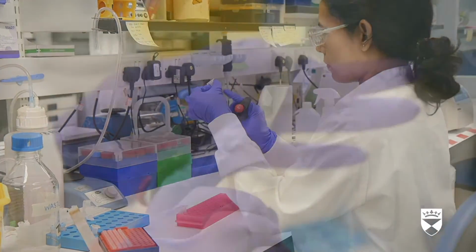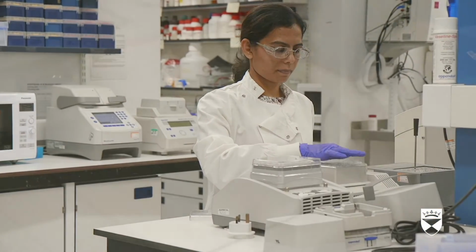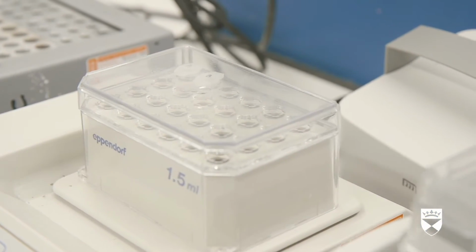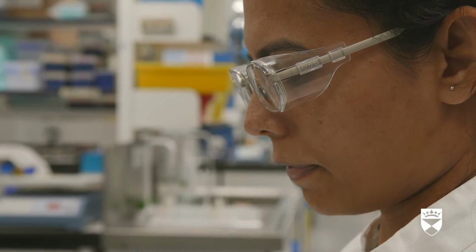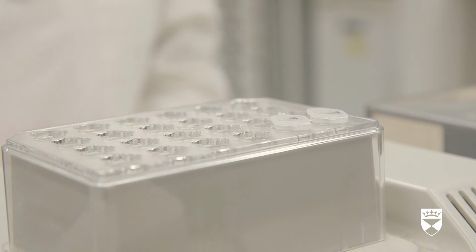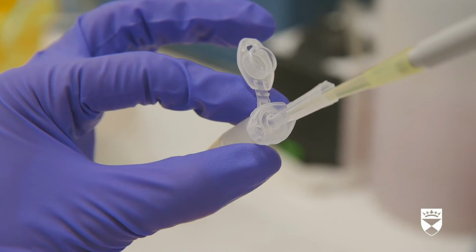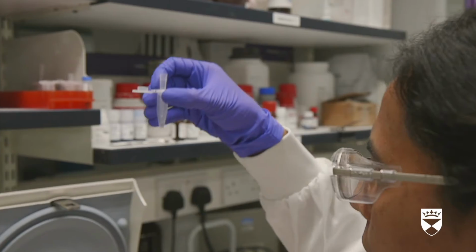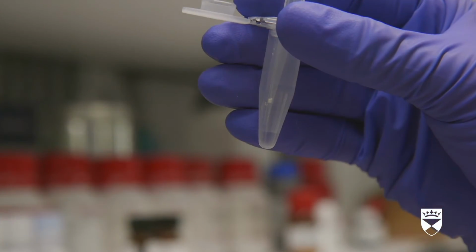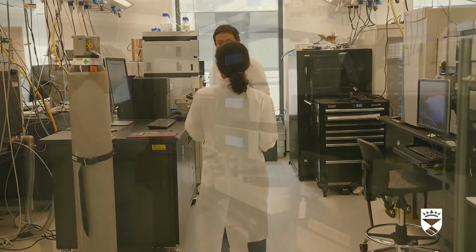Next, we add an enzyme to chop the proteins up to make them smaller. Then we put it in a thermomixer. This machine heats and mixes the contents. We call what we will study in the mass spec the sample. The sample is not quite ready to go into the mass spec yet. The mass spec is extremely sensitive to salt, so we need to remove salt from the sample. We are now ready to place the sample into the mass spec.